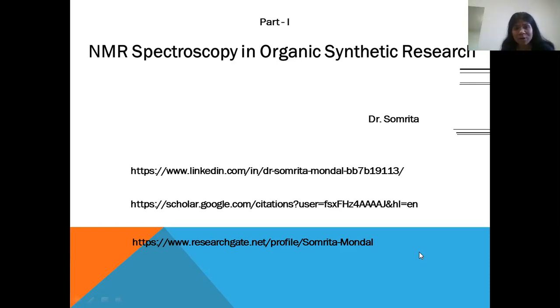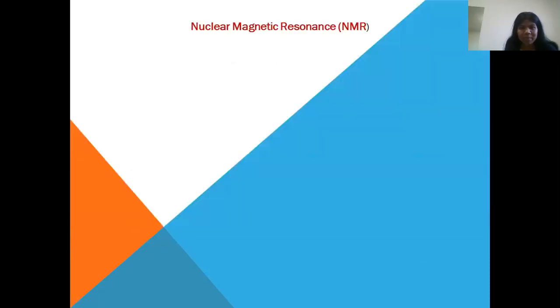This is a very important characterizing technique. Whenever people make new organic synthetic molecules, it's essential to characterize them with NMR. So I thought I should make a fundamental video on that. How do people characterize their molecules with NMR? So let's start the video.